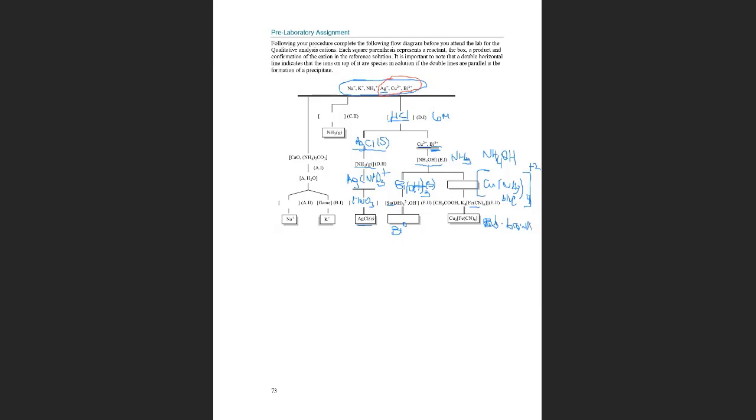And on this side that we have sodium, potassium, and ammonium, for the ammonium, all we did was test it when I showed you that we add sodium hydroxide. When you add a base to the ammonium, the weak acid, we tested it with the litmus paper.